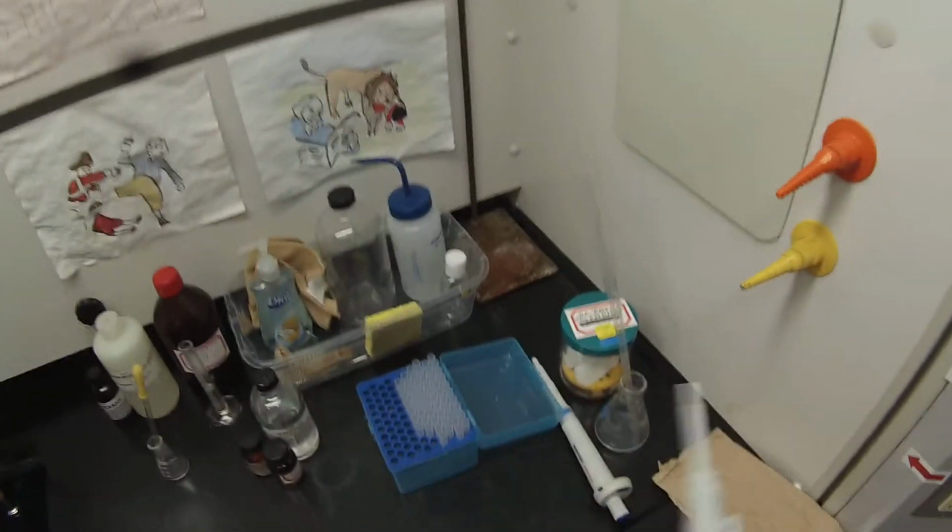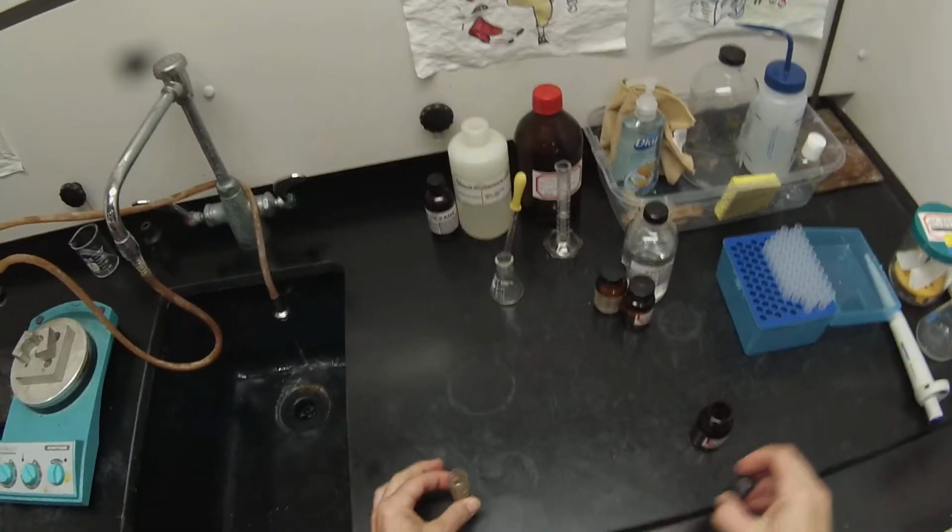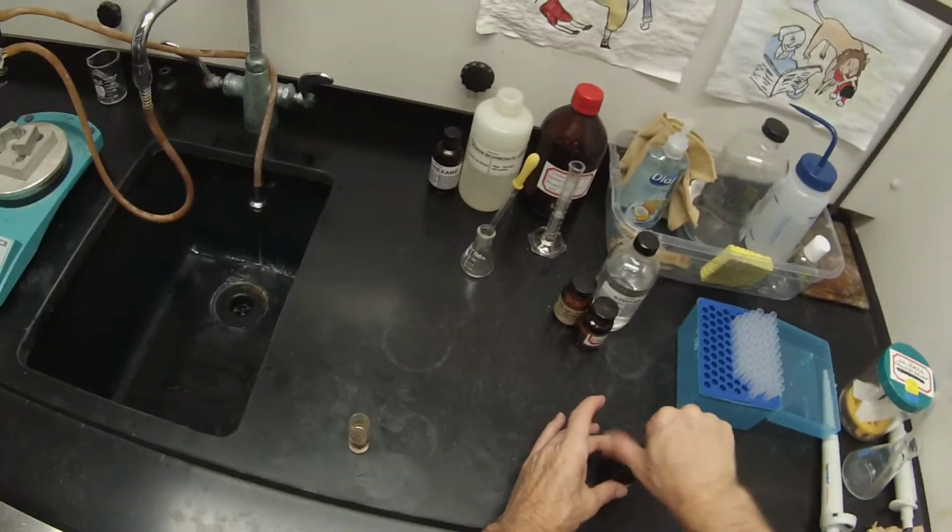I can get rid of that tip, and that way I can set this down. You never want to set this down horizontal when there's a tip attached because you'll contaminate it. That's my n-butyl all measured out.